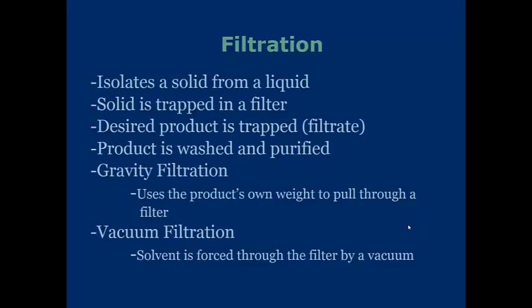Filtration is the isolation of a solid from a liquid. With an extraction, you're dealing with a liquid-liquid compound, but for filtration, you're looking at a solid that has not completely solvated into the liquid solution. What you do is you trap it in a filter, and the desired product is the filtrate. The product is then washed and purified subsequently.